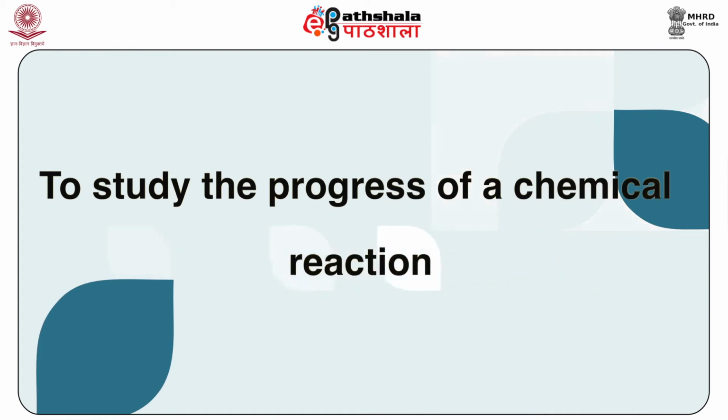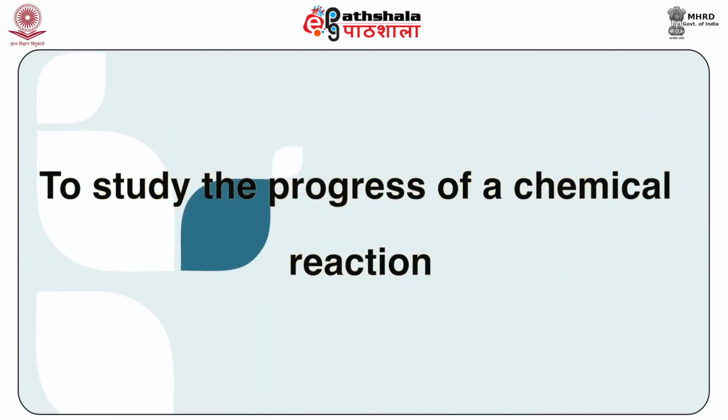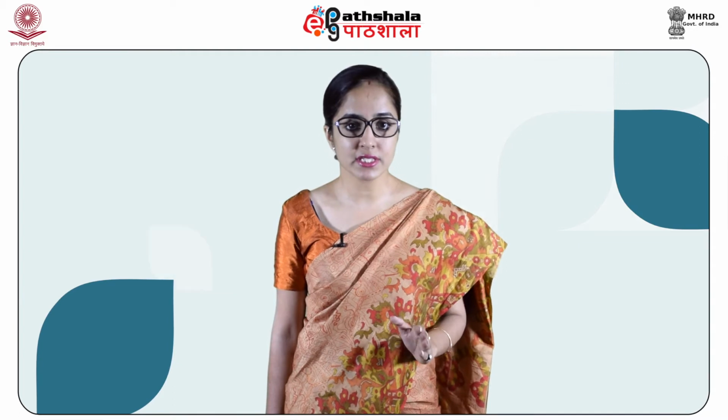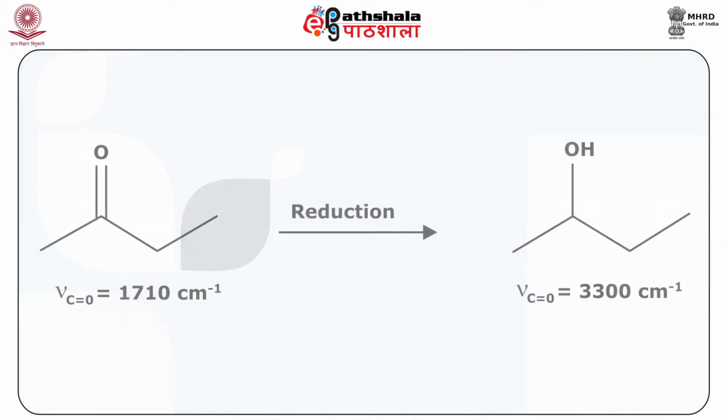Studying the progress of a chemical reaction is another application of IR spectroscopy. Progress of a chemical reaction can be determined by examining a small portion of the reaction mixture. As the reaction proceeds, some changes occur, such as disappearance of a characteristic absorption band of a reactant group and or the appearance of a characteristic band of the product group due to the formation of product as the reaction progresses in the forward direction. Let us take an example, students: the reduction of a saturated aliphatic ketone to form a secondary alcohol.